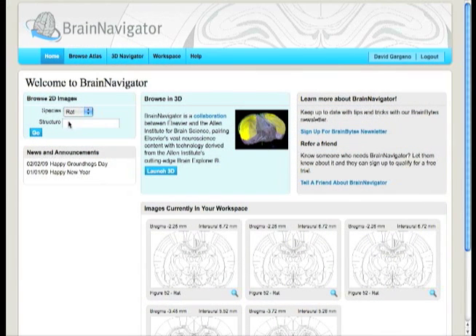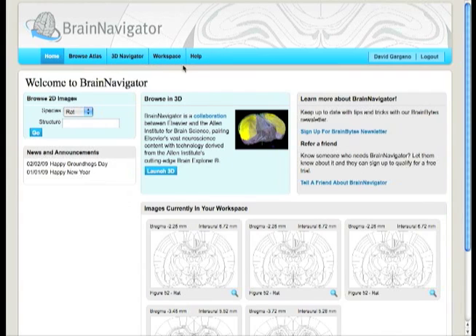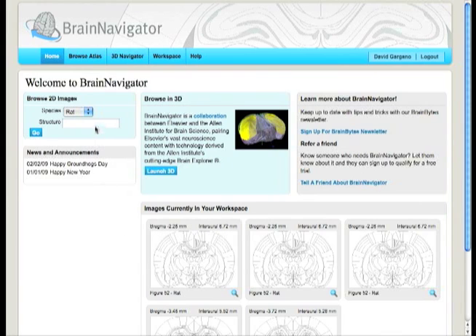When you log into Brain Navigator, you're presented with a home page with many navigation features. You can select any of the options from the top navigation bar at any time. There's also a handy feature called My Workspace that keeps track of the images that you've recently worked with, which is a great time saver.